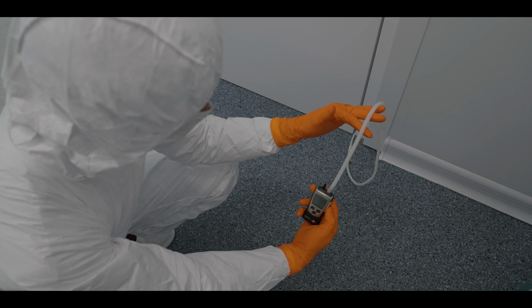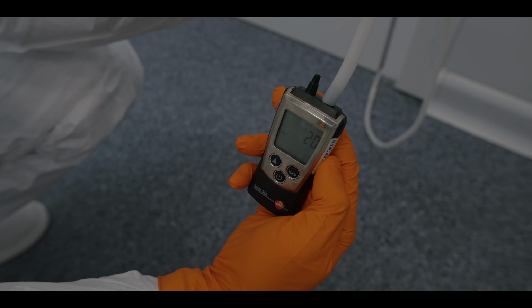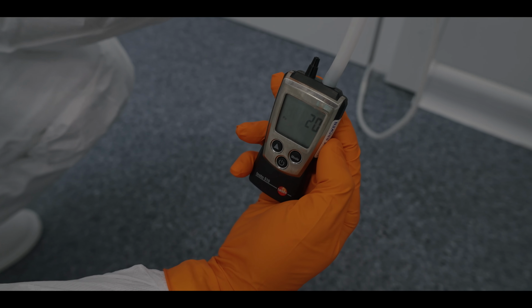In this instance we are measuring under the door. However, on some occasions permanent ports are applied to rooms for continuous monitoring purposes by means of an analog magnehelic or differential pressure gauge.